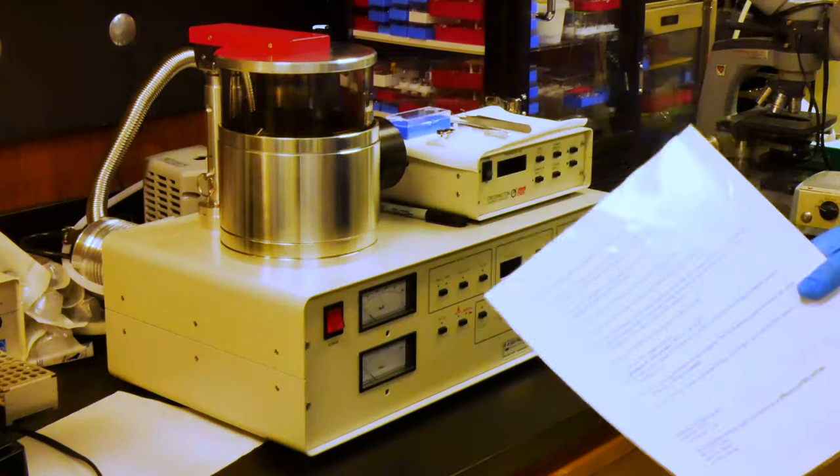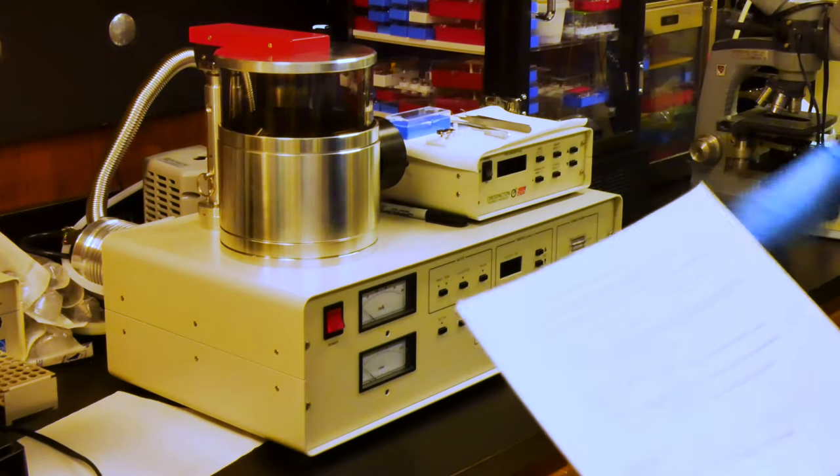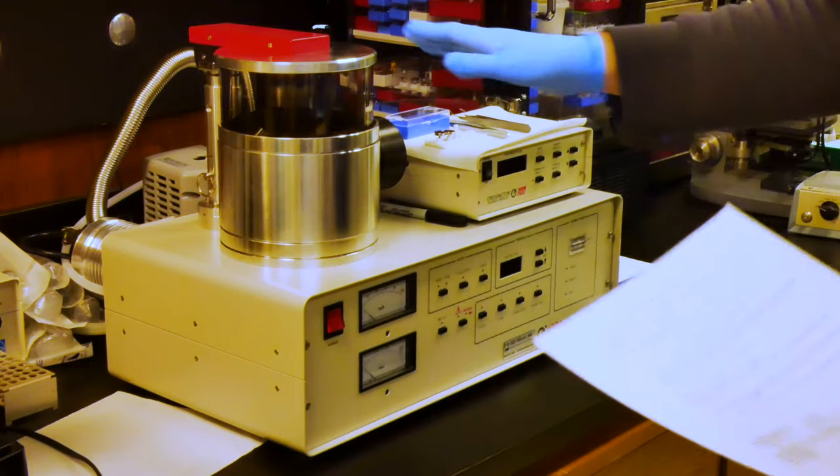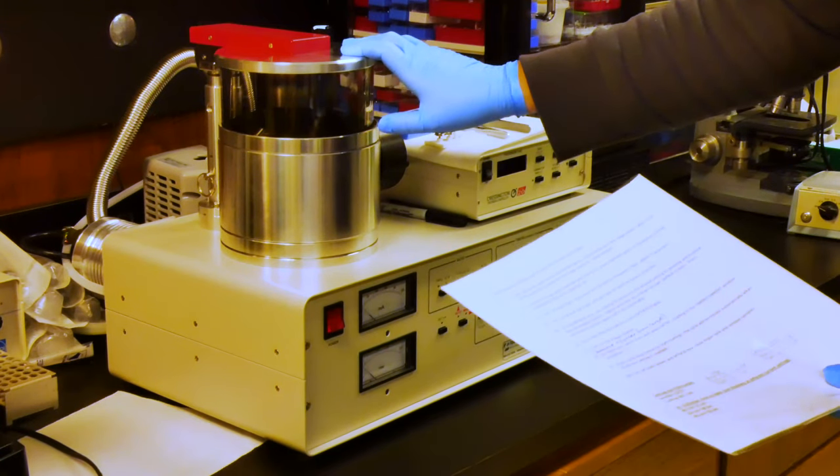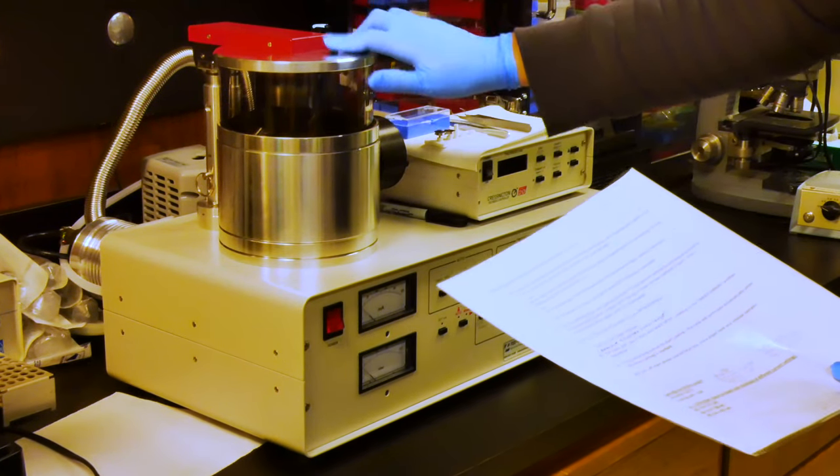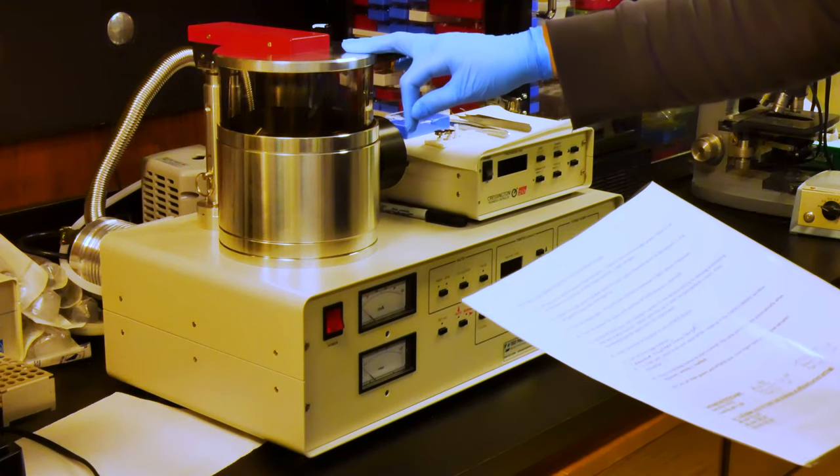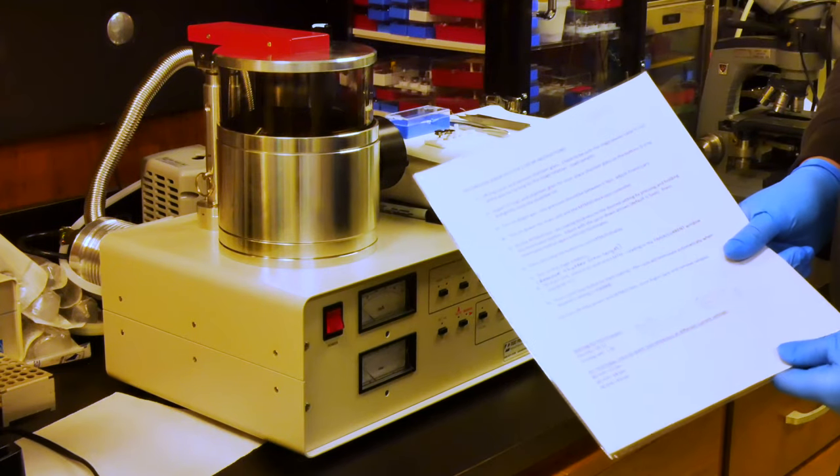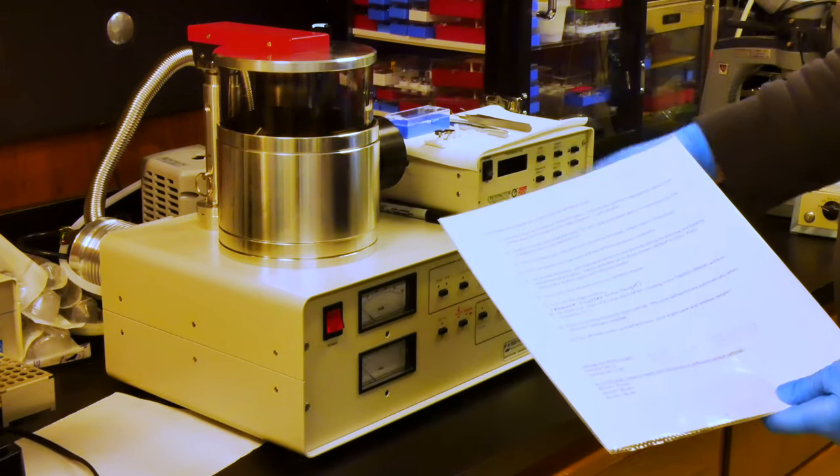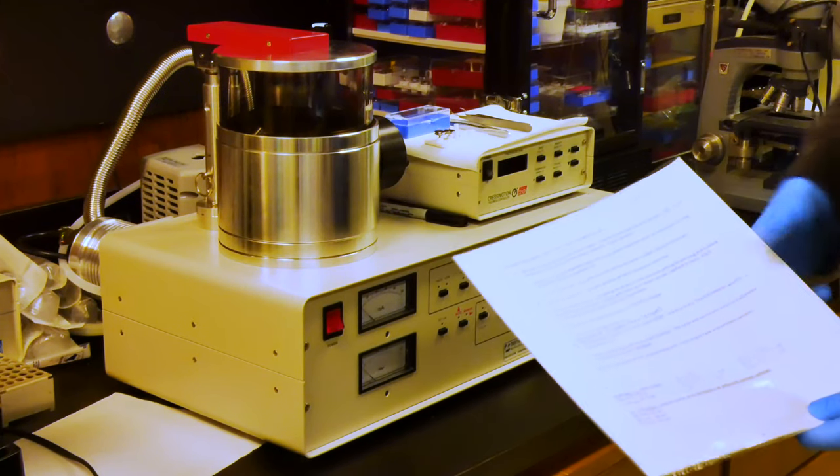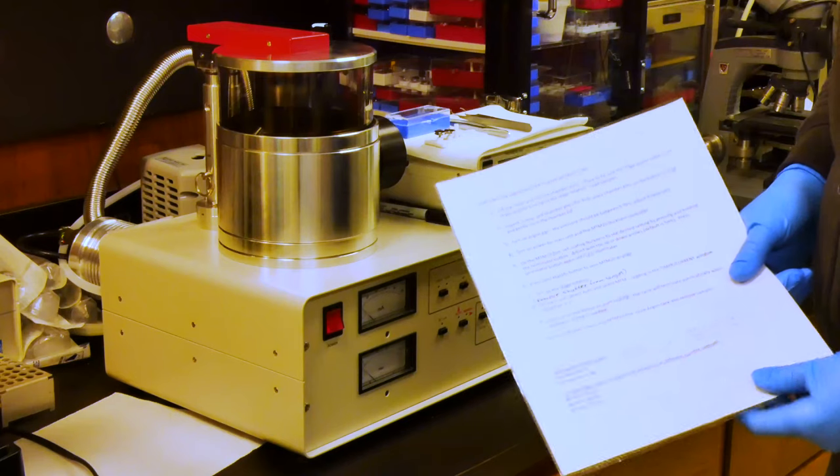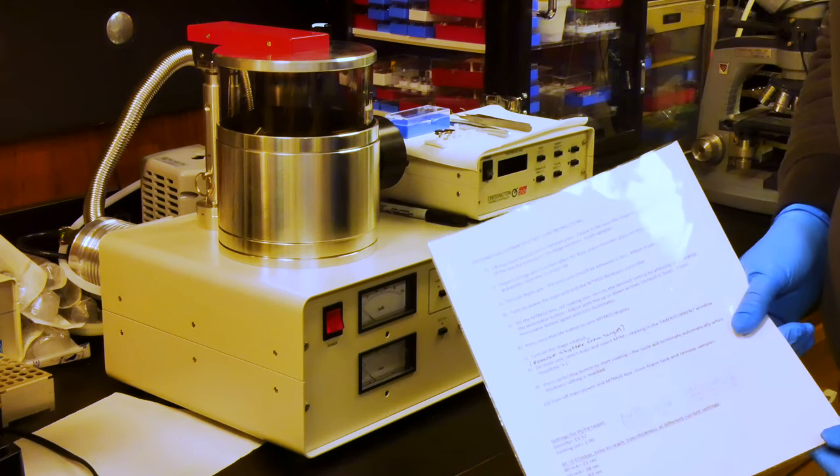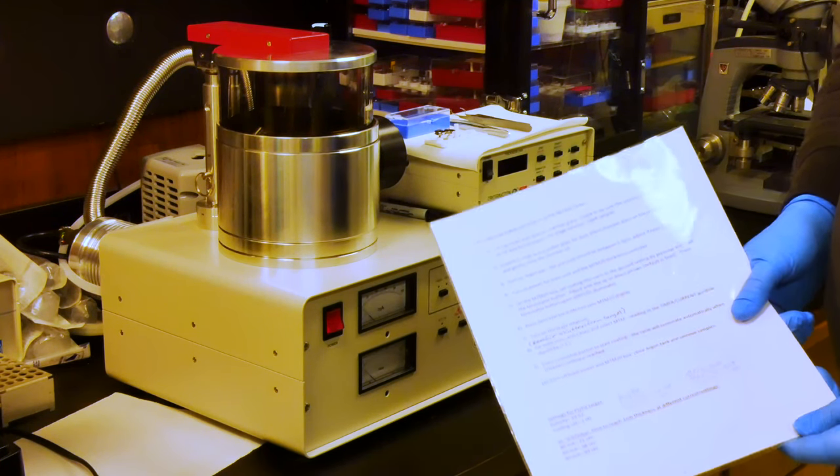To operate the Cressington sputter coater, we have samples that have been mounted that are now ready to be coated. Currently we are using a 60-40 gold palladium target that will sputter the metal onto the sample. That target can be exchanged. We also have a chromium one, but there are some additional modifications to the instrument that need to be made in order to exchange, and the exchange is also a bit of a process. Those other features would either be discussed one-on-one or will be followed up with an additional video training.